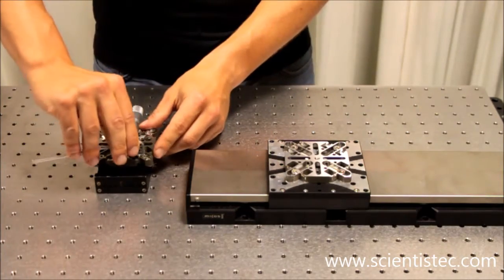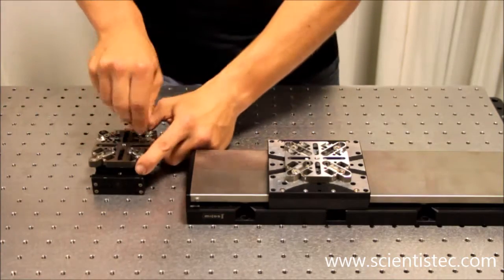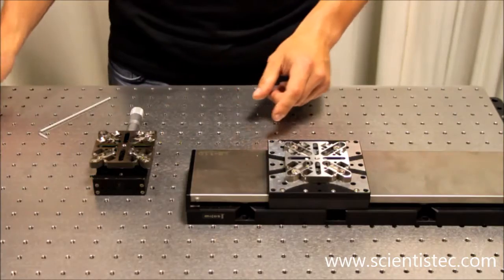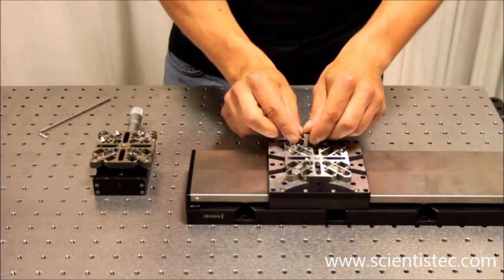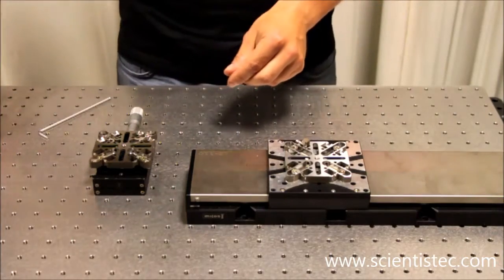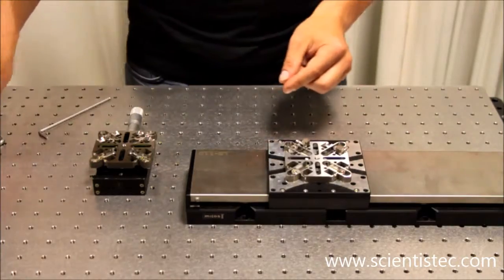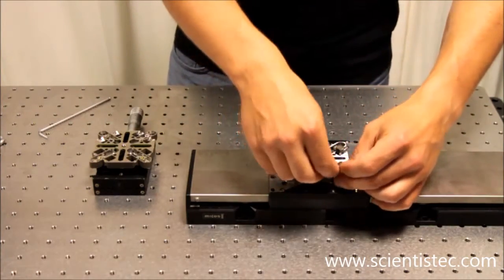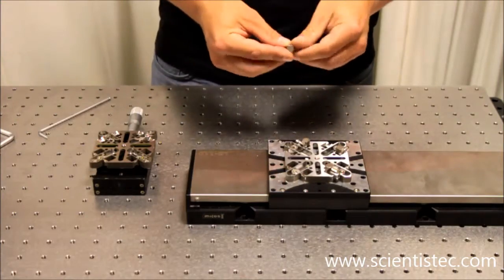After all screws have been tightened properly, the two adapters need to be connected to each other. Therefore I use the connection blocks which are included in the set and plug them into the first adapter. To achieve high stiffness, I use four of them. The connection block screws are pointing outwards to make sure they are accessible even when mounting large devices.